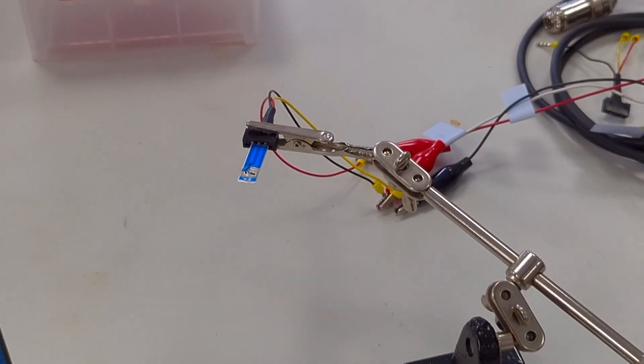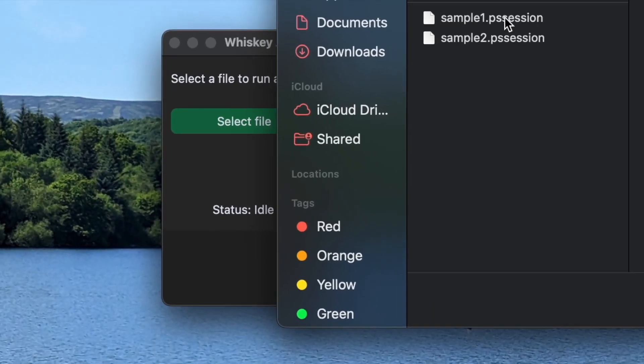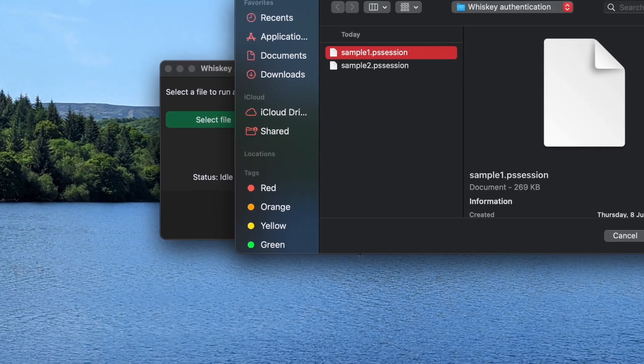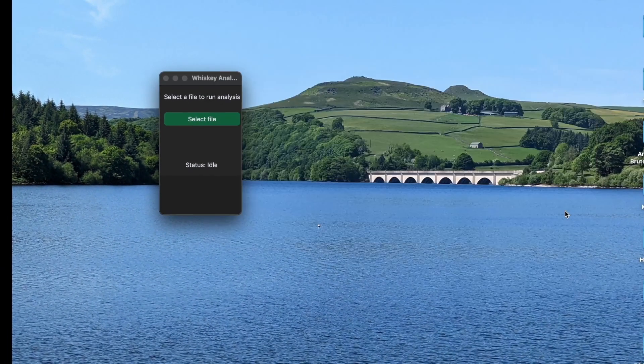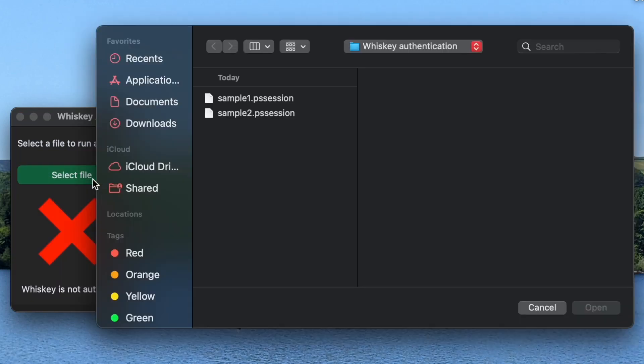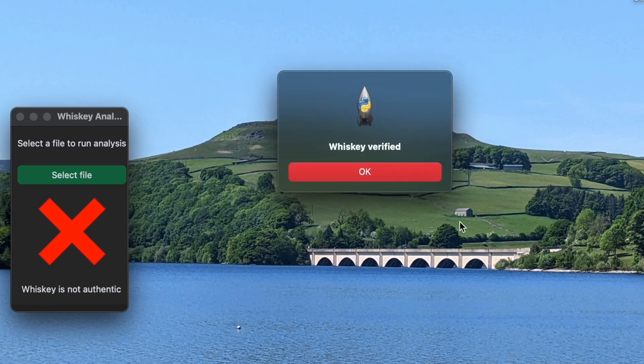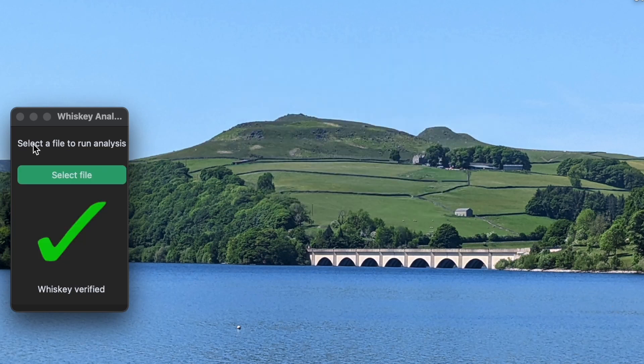Once the data has been collected, we can simply open the data file from the respective potentiostat software in a whiskey analysis software. The software will then tell us if the whiskey is authentic or not. In this case, sample 2 is the authentic whiskey, whereas sample 1 was adulterated.